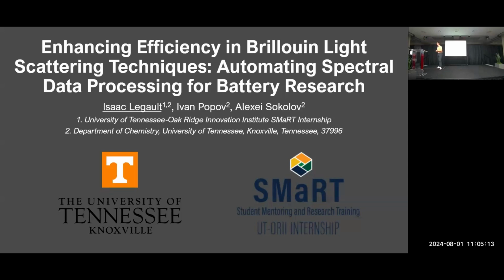Hello. My name is Legault. I'm an upcoming junior mechanical engineering student at Tennessee Tech, and I'm going to go over my research project this summer. I was under Alexei's soft matter research, specifically in the battery storage section under Ivan Popov, and this is my summer research project: enhancing efficiency in Brillouin light scattering techniques, automating spectral data processing for battery research.